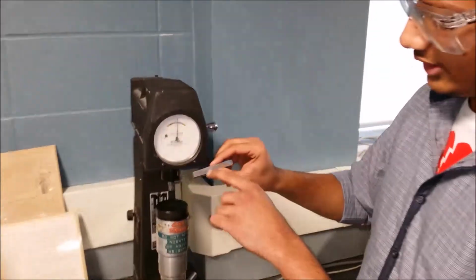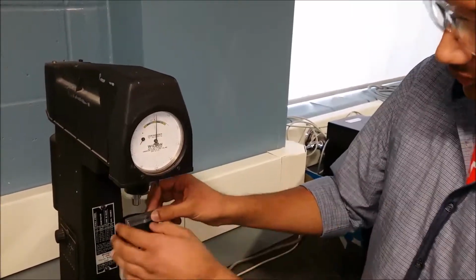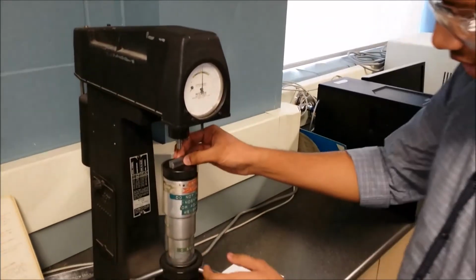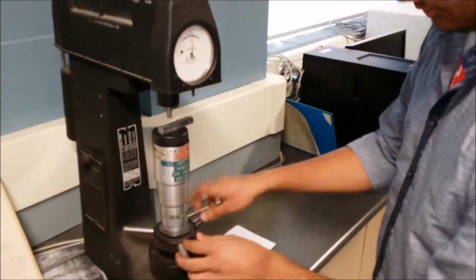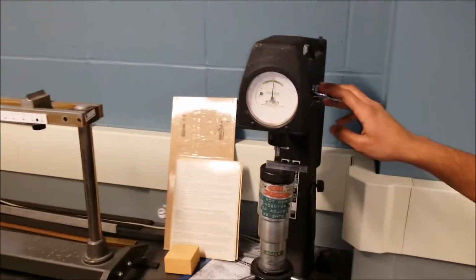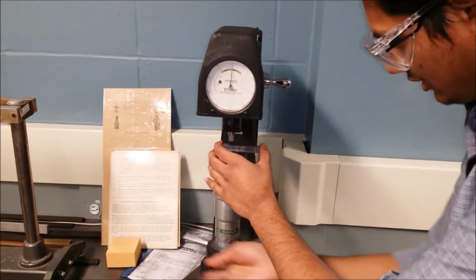We have all the old tests down here, so we have to keep it around 0.25, a quarter of an inch, away from those, so we can have a better result. So what we do is place it here properly, and then take the piece up there. Before that, we have to make sure this load always has to be up here. It's like a minor load, it has to be right here.